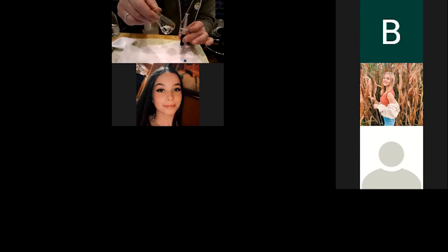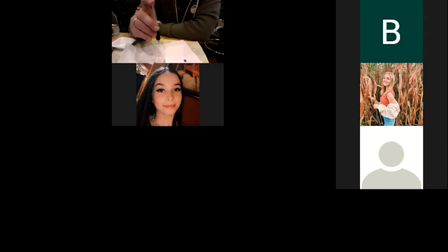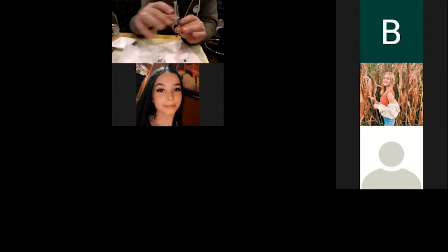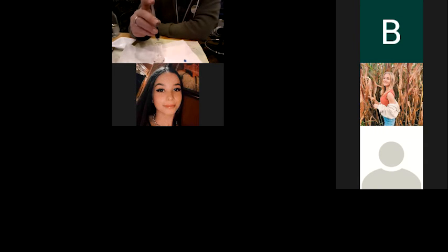So you see I got a drop on the side, so I want to make sure I get that. I swirl it and it goes clear. So I just keep going. Oops. So you can see there's a little bit of blue in there. Swirl it around. Oh, well, still got a ways to go.